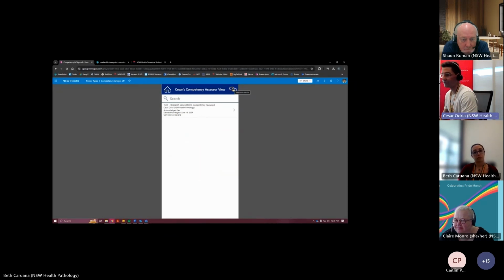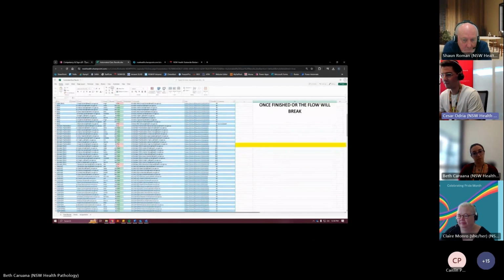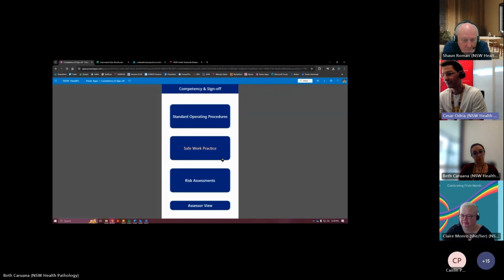Clicking on this, we can see the quiz results, because some of our protocols have a quiz where you need to achieve a pass on a quiz to be competent. So that's just a quick way to access that.